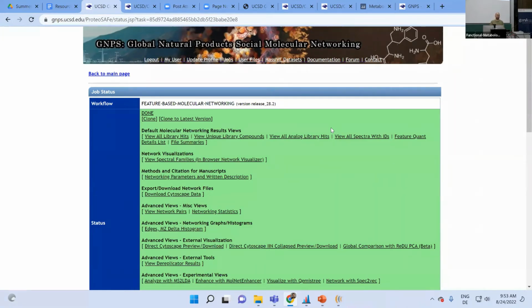So I think really understanding the principles underneath and knowing your data set a little bit is important, but there's certainly no perfect answer. There's no column where you apply a threshold and say, okay, this is optimized. I mean, we already apply some thresholds. The standard is a cosine similarity of 0.7. Then 6 matched signals, which is already a lot for very small molecules.